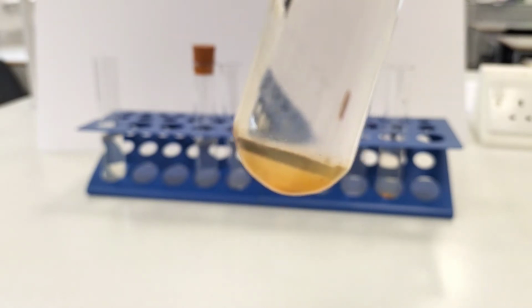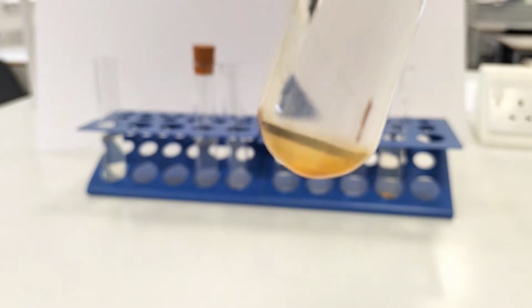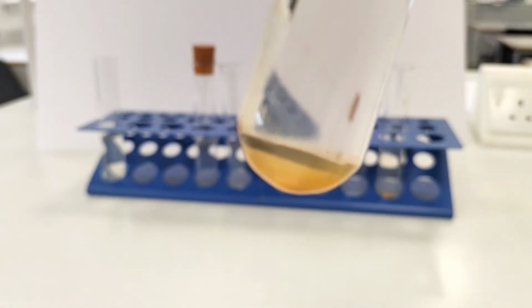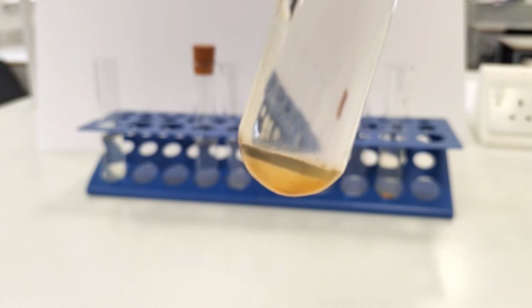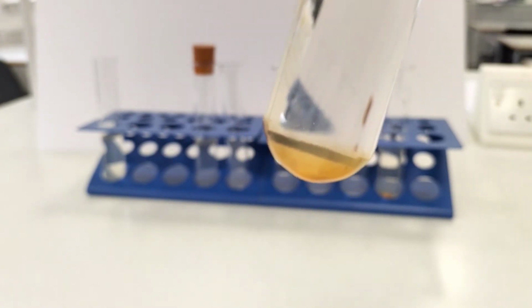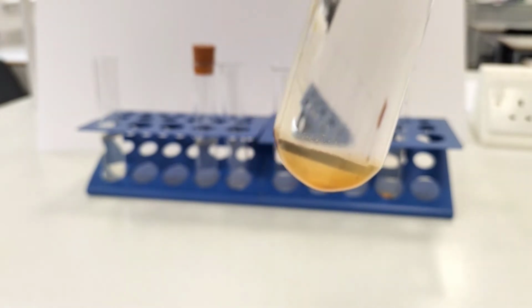So it appears to be the case that salt increases the speed at which rusting occurs. Now, I wouldn't say that salt is a catalyst for rusting, but it certainly seems to be an advantageous environmental factor in increasing the speed and extent of rusting over a short period of time.